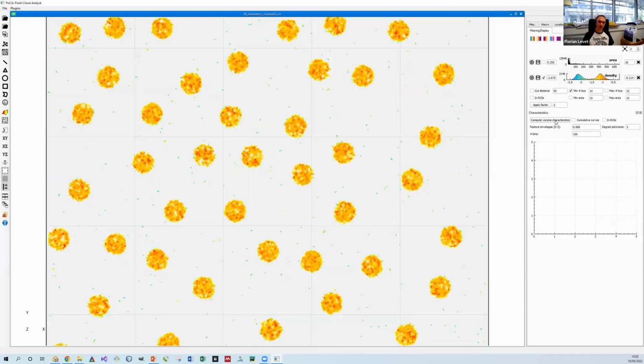So it does some simulation in the background, finds the two distributions where they cross, and applies thresholding in order to do clustering. You can see that it's still ongoing since it doesn't show the curve as it should.